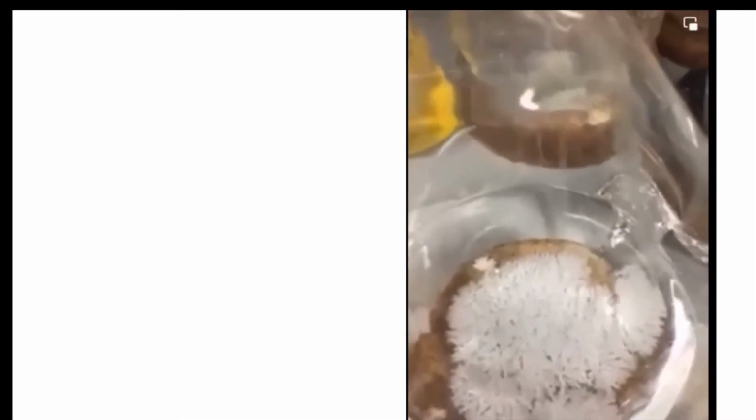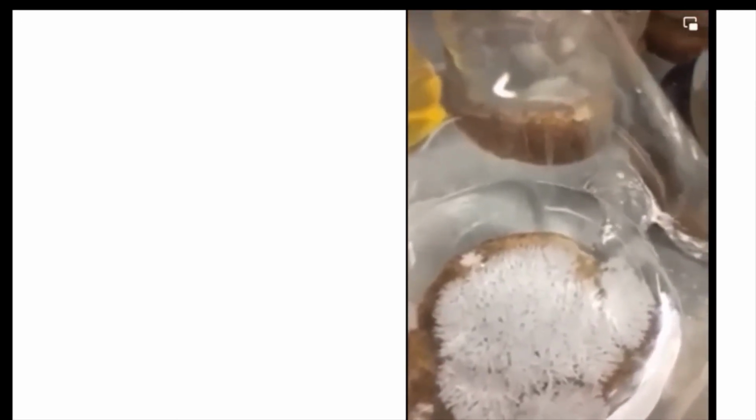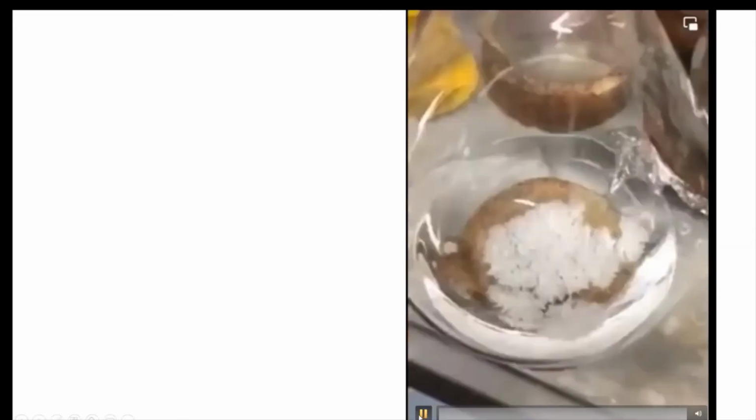In many cases, this is weird, but I have grown some crystals in THF. That is rare, but it is possible. You have to dissolve your compound, heat it up in THF and leave it at room temperature for maybe a couple of days. Then you will get crystals from THF.